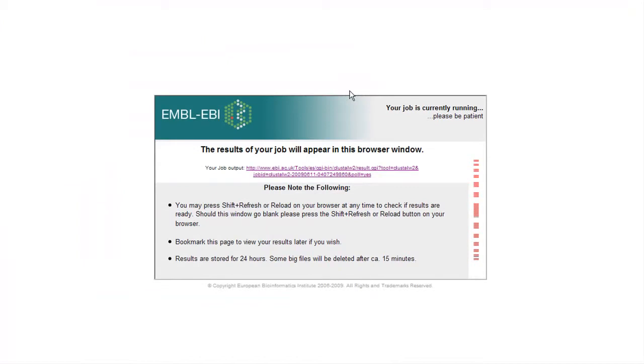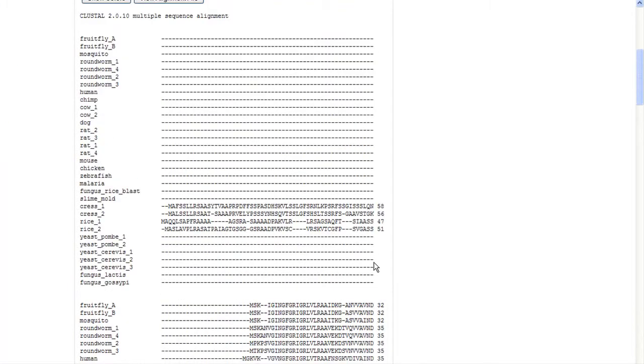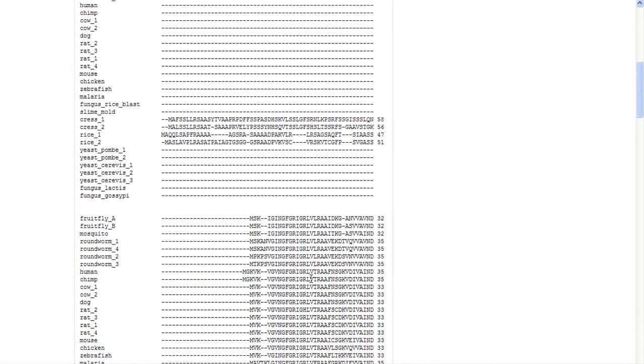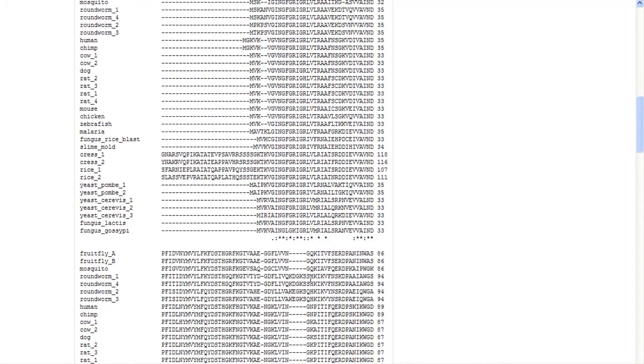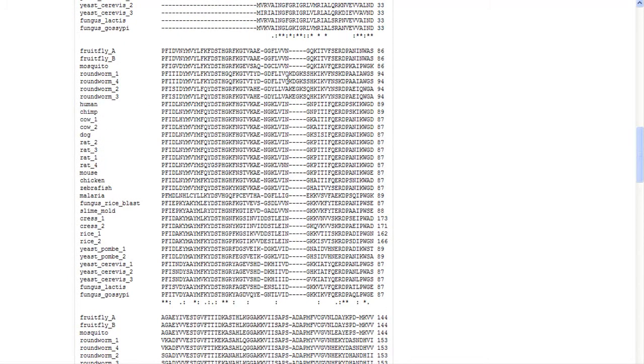And I don't change any of the settings here. And it will take about 30 seconds to finish processing the job. I'm going to speed time up like they do on the cooking shows and cut to an already finished product. So I've already run this job. What it's giving me here is a very plain vanilla alignment of all these sequences. And it's put the names next to them so it's a little bit more interesting to look at. It has allowed for gaps, so when you see a dash, that's where it inserted space to allow for the alignment of the sequence.